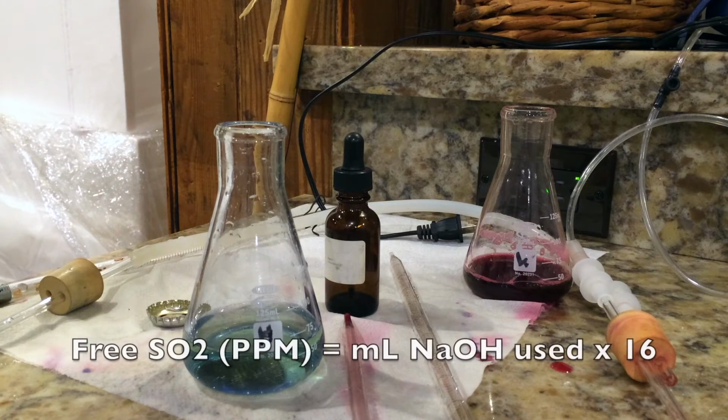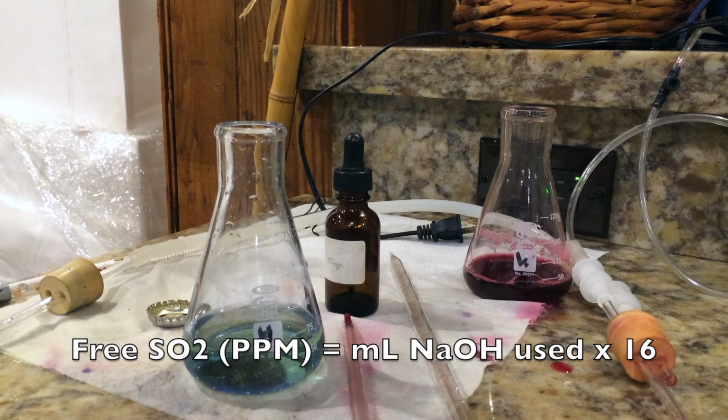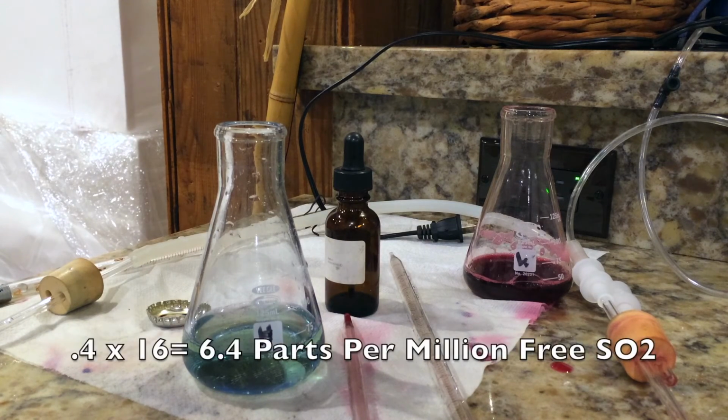Basically, you just take the milliliters of sodium hydroxide that you added and multiply it by 16. So since I had less than 1, there's actually going to be less than 16 parts per million here. Since I added less than half a milliliter, it's going to be less than 8 parts per million here. So I really need to bump up my SO2. This is why you always need to keep checking, because you don't know how much is going to be bound up from your first addition, and you don't know how much is going to be used up by oxygen exposure in your barrel or carboy.